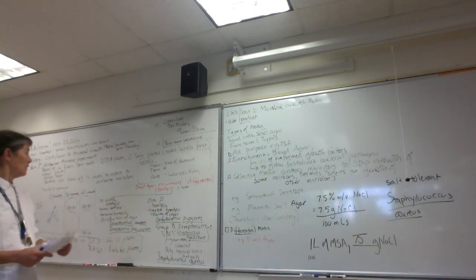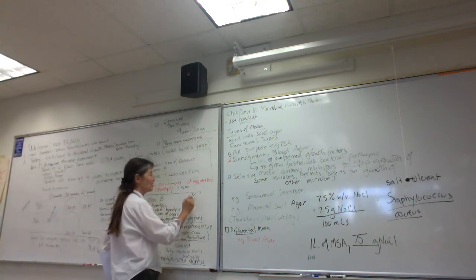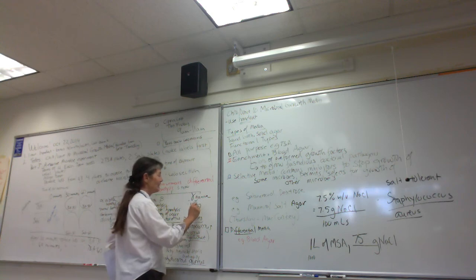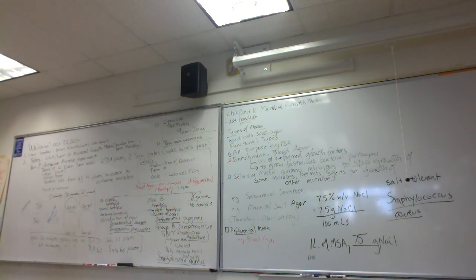Excellent. And then the last type of hemolysis, you guys, I do not know why they named it hemolysis. It's called gamma hemolysis, and it's no hemolysis. That's silly. Why would you name it gamma hemolysis when there's no hemolysis? Oh well. So folks, most microbes are gamma hemolytic, right?